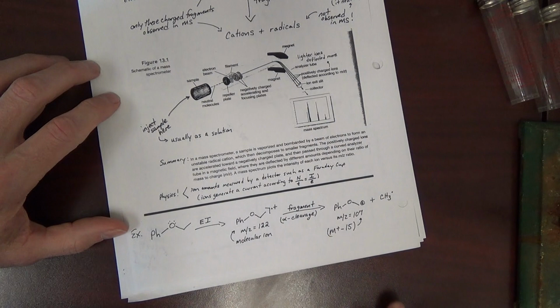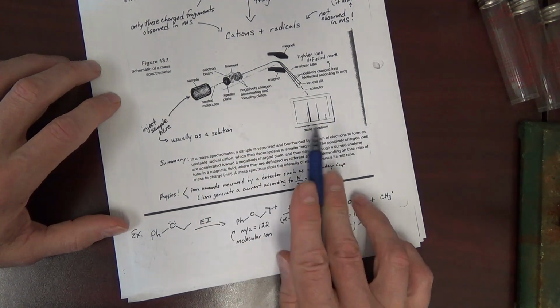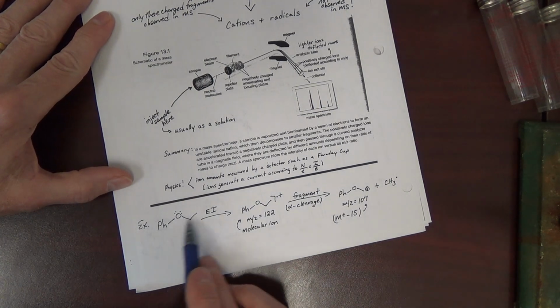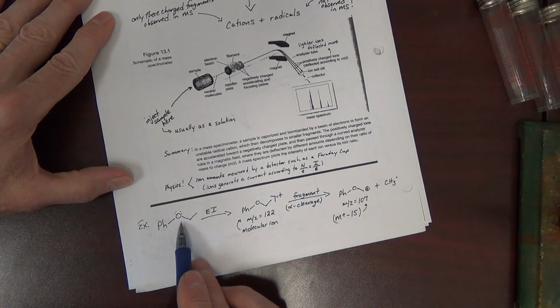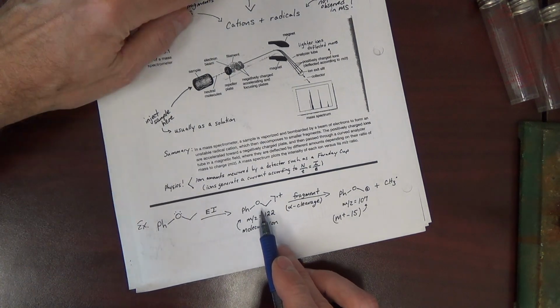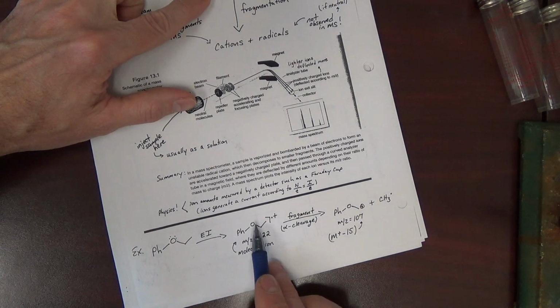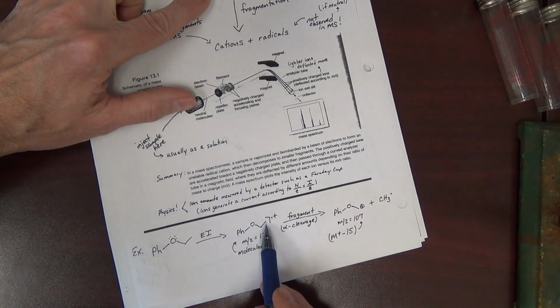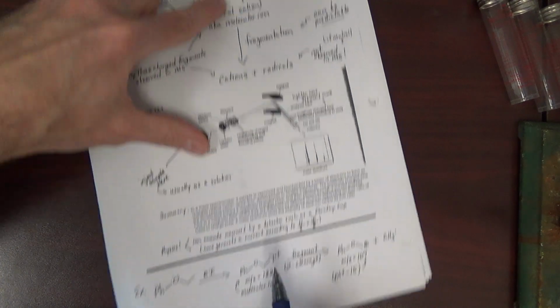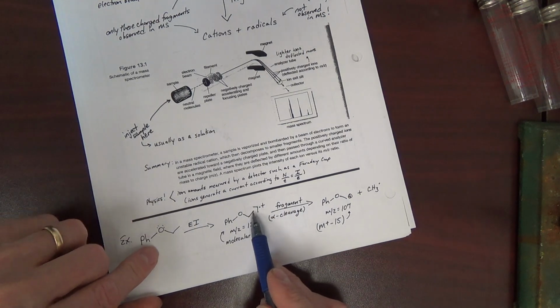We'll take a little bit of reading about what's going on under the hood here, and ultimately how do you get different peaks from your mass spec and why do they correspond to mass. Let's look at an example here at the bottom. Let's say we take this molecule here, it's an ether. Okay, it's got a certain molecular weight. It undergoes electron impact, an ionization method. The molecule is converted to a radical cation. The radical cation is often shown very generically, maybe a box or a partial box around the molecule, and then the radical and the charge. Up top I drew the charge first, then the radical. Either way works. This indicates that now it's a radical cation.